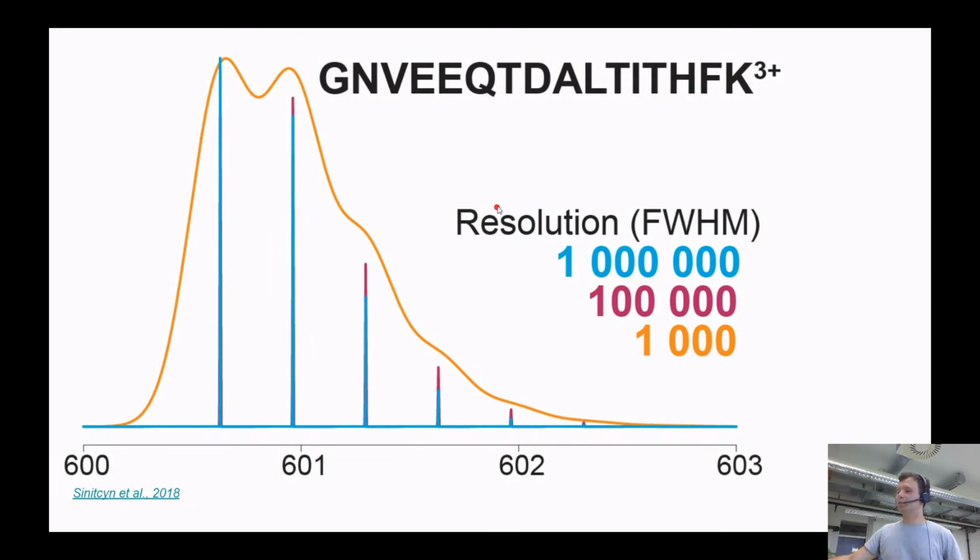Imagine that we prepare a sample which consists of just one specific peptide, and this peptide has a charge of 3+. Let's say the approximate mass of this peptide is something like 1,800 something. So if you divide by 3, it should be a value like 600.66666.